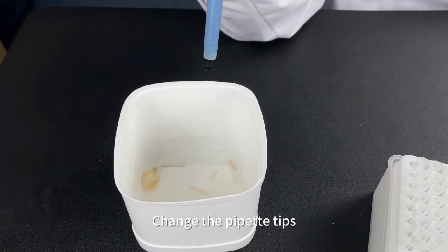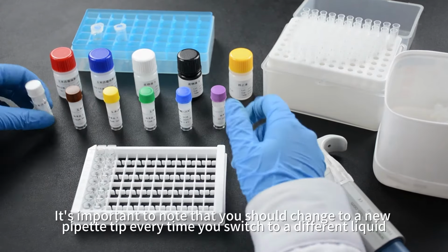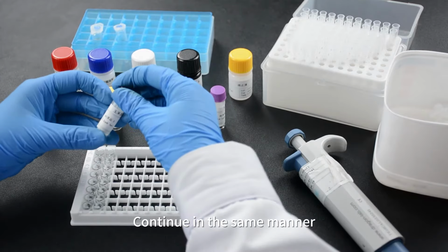Change the pipette tips. It's important to note that you should change to a new pipette tip every time you switch to a different liquid. Continue in the same manner.